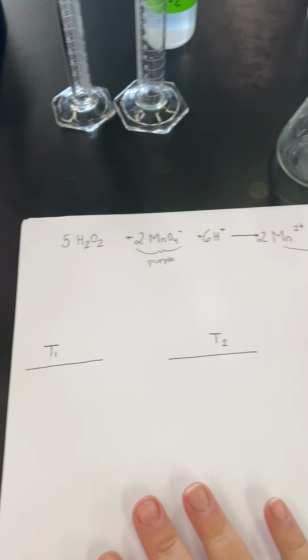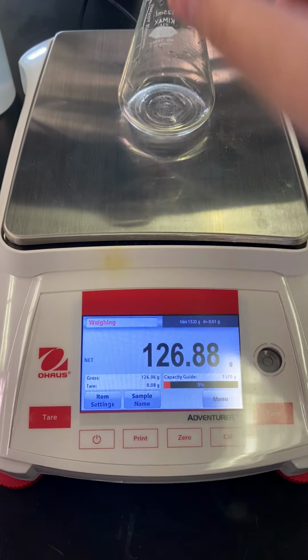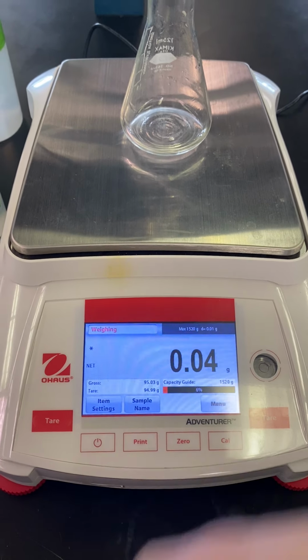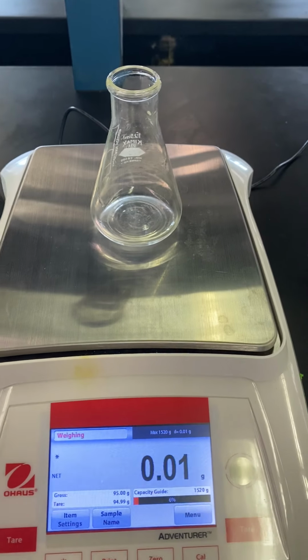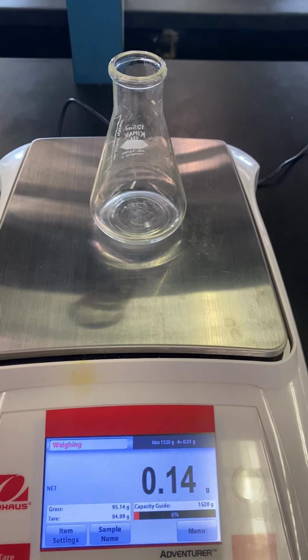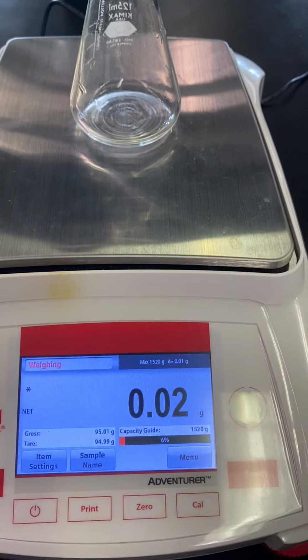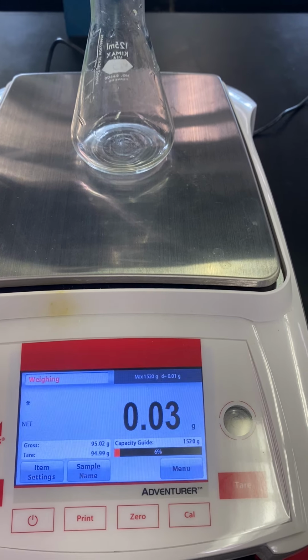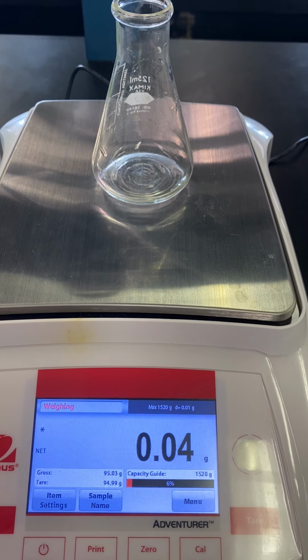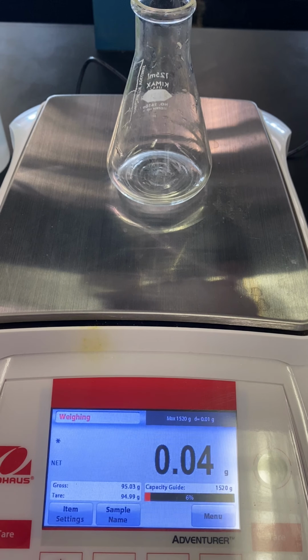Okay, so we're going to start off by putting onto my balance our Erlenmeyer flask, and I'm going to tare my balance to 0, and I am going to weigh into that Erlenmeyer flask roughly 6 grams of the hydrogen peroxide solution. This doesn't have to be exactly 6 grams, so whatever it ends up being, I'm just going to record in my data sheet. Okay, do notice my balance is jumping around a little bit. It's just from draft of the wind, and that little bit of fluctuation is just going to be some error in our calculation, and that's just part of working in a lab.